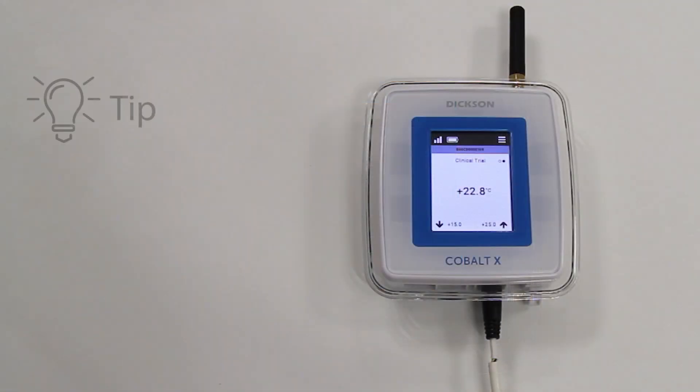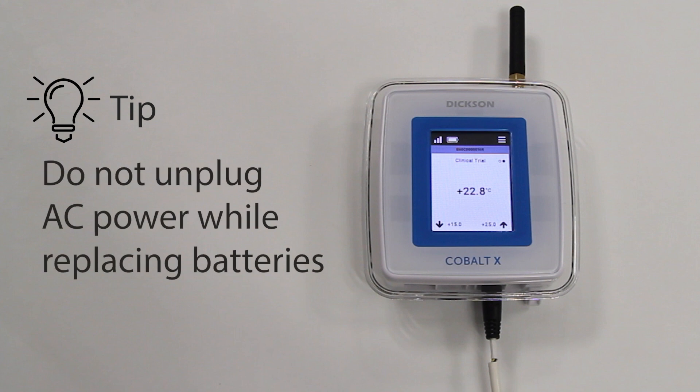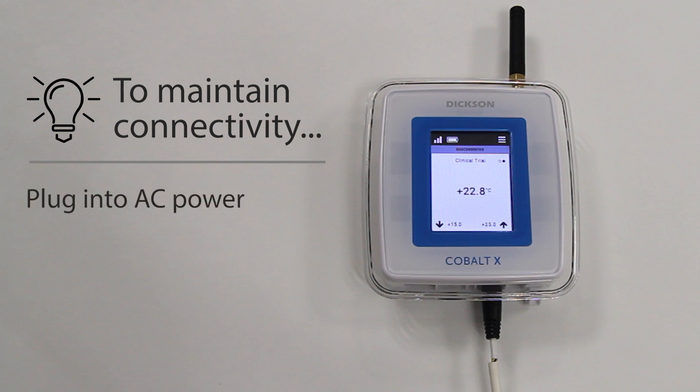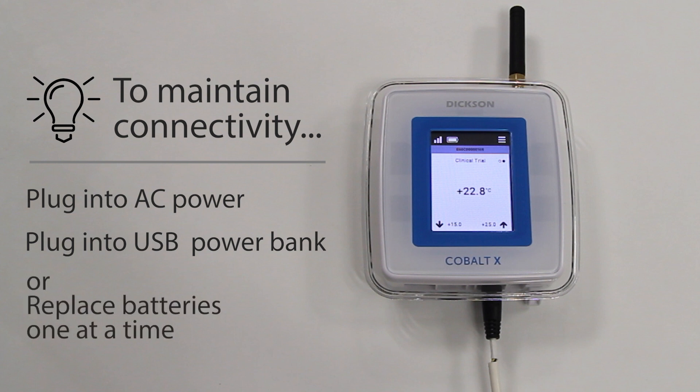Unplugging the sensors or the AC power cable is not required for battery replacement. To maintain connectivity of the COBALT-X, you must either have the unit plugged into AC power, connect it to a USB power bank, or replace the batteries one at a time. This will ensure that the device will continue to function without interruption.